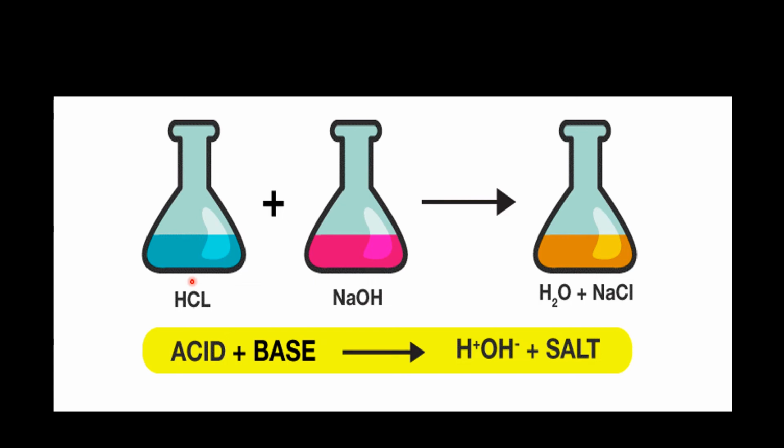Basically, I am using hydrochloric acid solution and sodium hydroxide solution, so I have to know the chemical equation. Why do I have to know the chemical equation? Because to carry out the calculations, I need to know the number of moles. So, memorize this equation. In this, 1 mole of hydrochloric acid is reacting with 1 mole of sodium hydroxide solution, and definitely this is the most famous neutralization reaction, and at the end we get the salt and water.